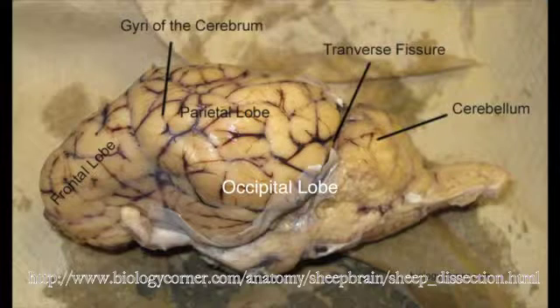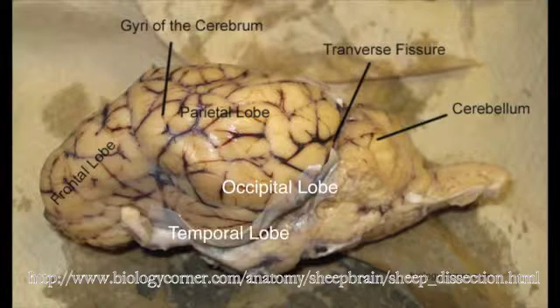The temporal lobe is our third area of interest. We wanted to learn more about memory formation. Through our research, we discovered that the hippocampus, which is a structure within the temporal lobe, is heavily associated with memory formation. However, it is important to note that memory formation is a very complex function of the brain and involves many more areas than just the hippocampus.